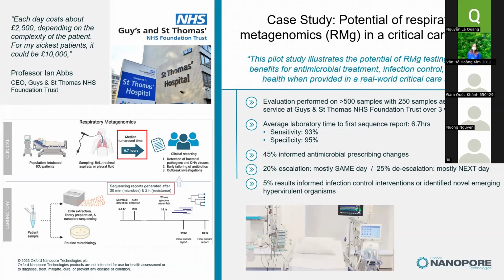If you are familiar with nanopore sequencing, you'll know that there are three types of basecalling model. Fast uses the least computing power and enables you to get the sequence fastest. However, it also has a higher error rate.